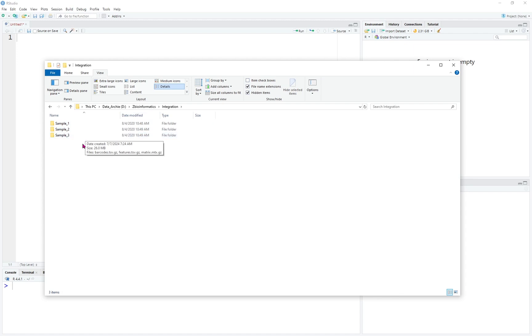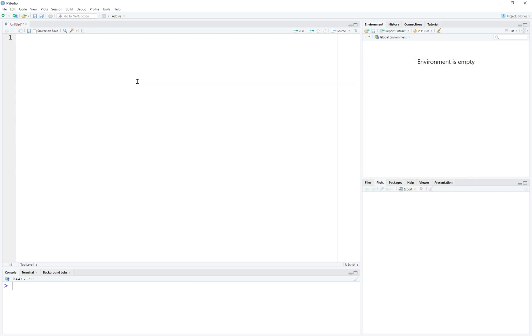Now you have three samples: sample 1, 2, and 3. For sure, you can have way more samples than this, but we're going to integrate the three samples as an example. To integrate these three samples, let's first import the library Seurat.